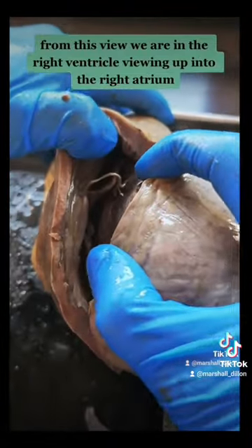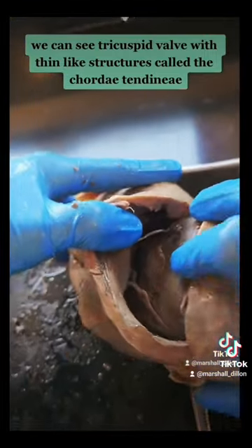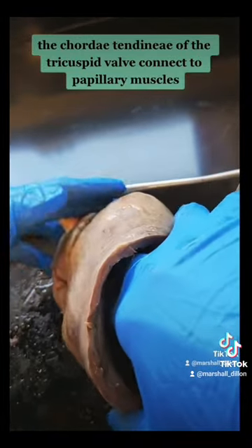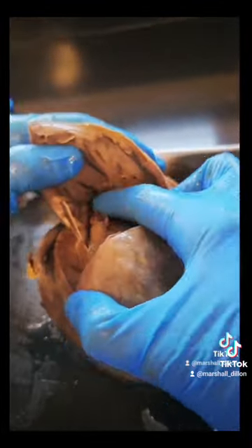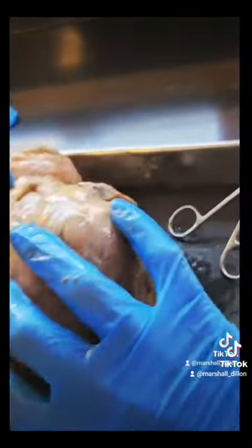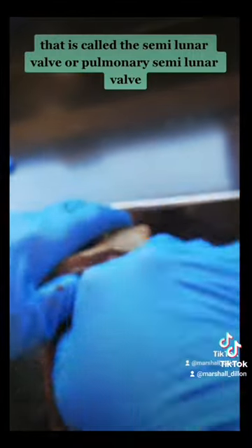From this view, we are in the right ventricle, viewing up into the right atrium. We can see a tricuspid valve with thin-like structures called the chordae tendinae, along with the moderator band, or M-band. The chordae tendinae of the valve connect to papillary muscles. You can see the lining of the ventricle, which is trabeculae carneae. The valve connecting to the pulmonary trunk is called the semilunar valve, or pulmonary semilunar valve. You can usually feel it.